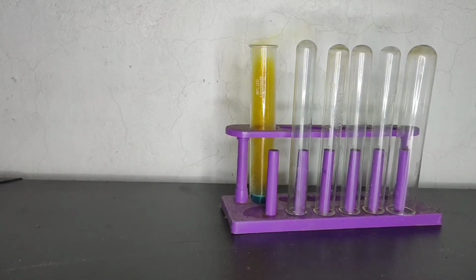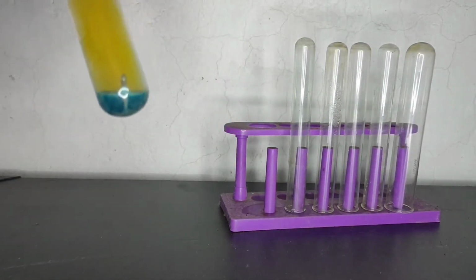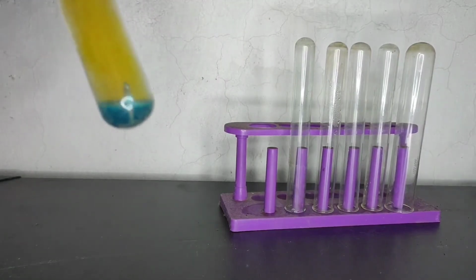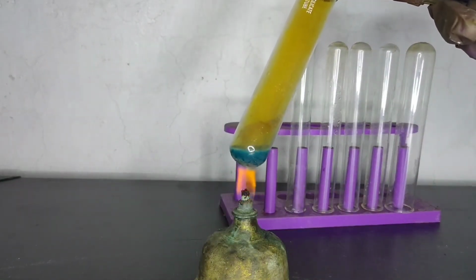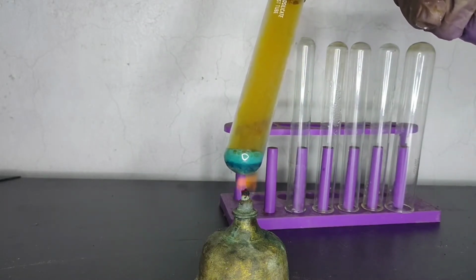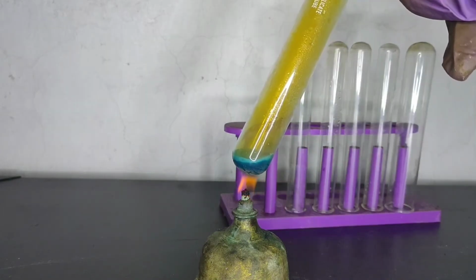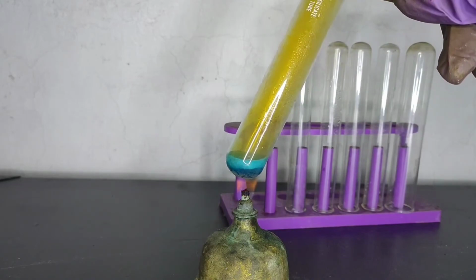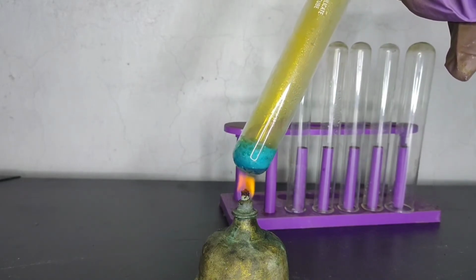After some time, the reaction died. So I decided to heat this solution. On heating, the reaction proceeded faster. You can see that now the ring is rapidly reacting with nitric acid. Silver nitrate and copper nitrate solution is being formed as the ring dissolves in nitric acid.